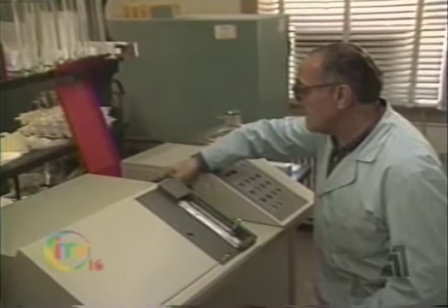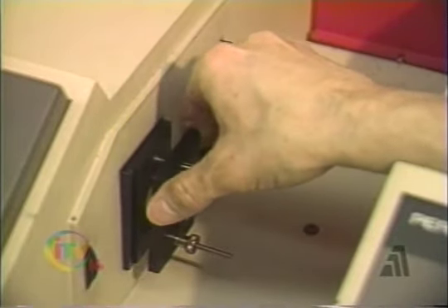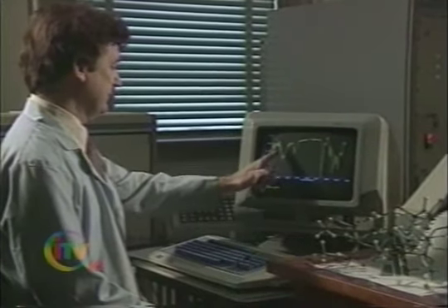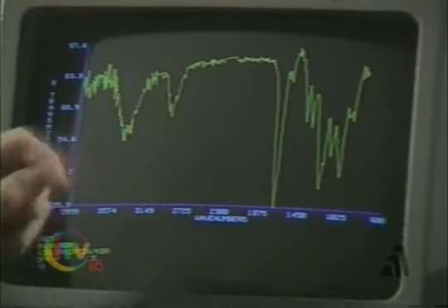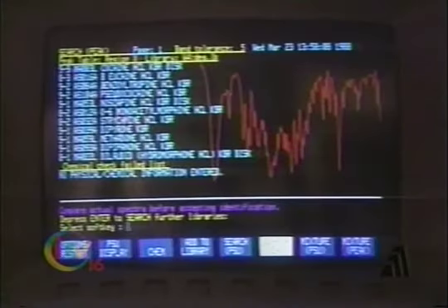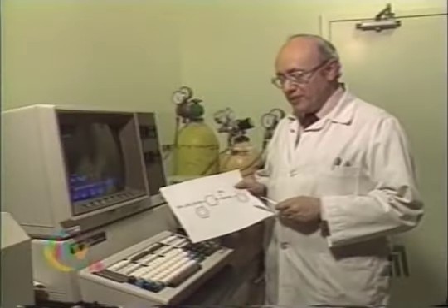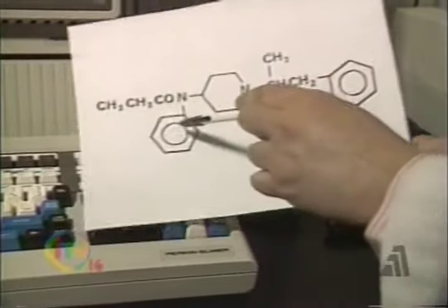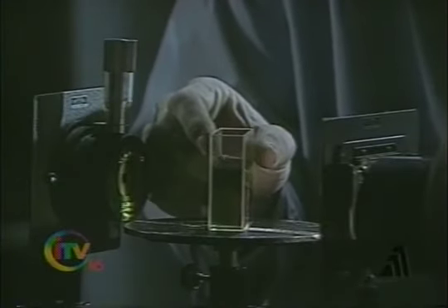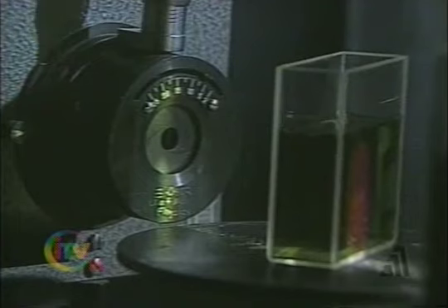Spectroscopy is an analytical method that makes use of molecular absorption. A beam of radiation is sent through a sample, and a spectrum shows which frequencies have been absorbed and which ones have passed through. The peaks and valleys of the spectrum provide clues to the sample's molecular structure. Spectroscopy is used to identify substances by matching their spectral fingerprints with known spectra and to decipher the structure of previously unknown molecules. Whatever the use, all spectroscopic analysis is based on the same principle, that molecules can produce their own signals from within.